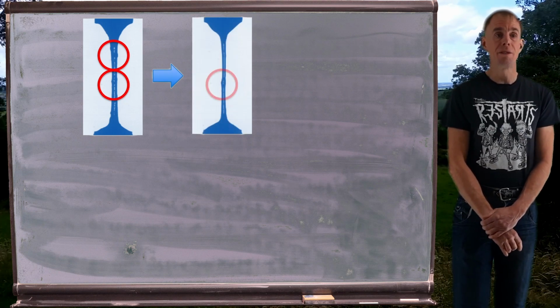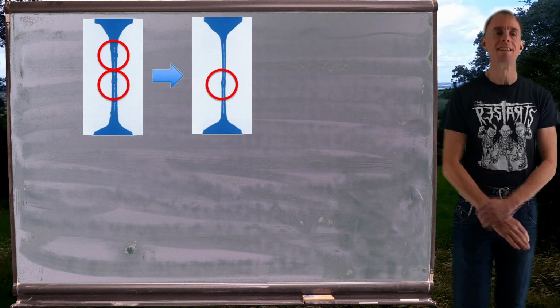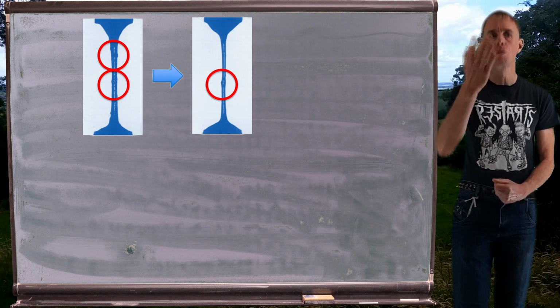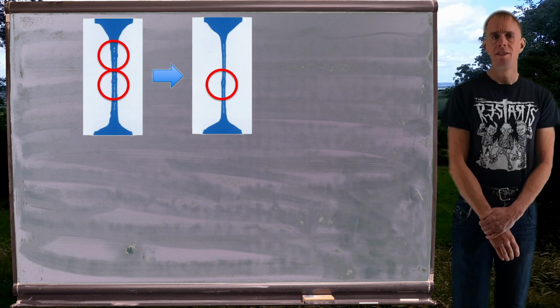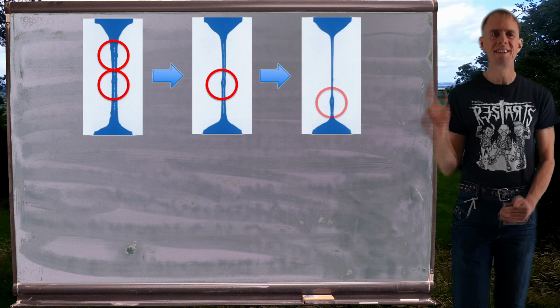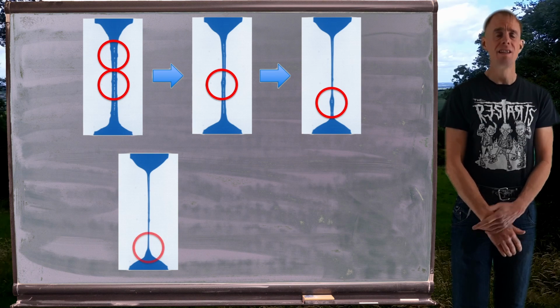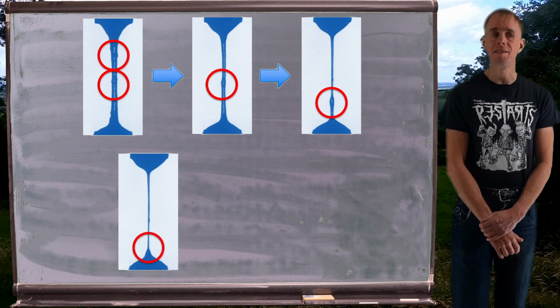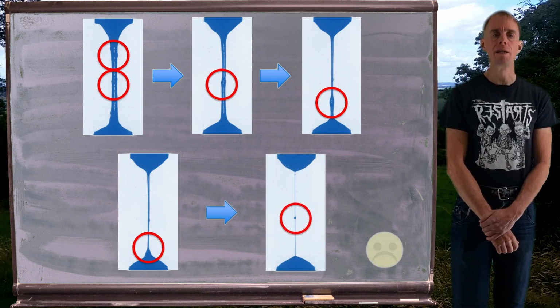So as a fluid filament thins a little more, again you can see this inhomogeneity within that fluid filament. Again, if you look at the symmetry of the fluid pools on the pistons top to bottom, they're not particularly symmetric. So all in all, this is going to give you pretty bad data, and you wouldn't really use any filament thinning data from an experiment like this. You just couldn't trust it. And again, there you go, the final image is another bead on a string.